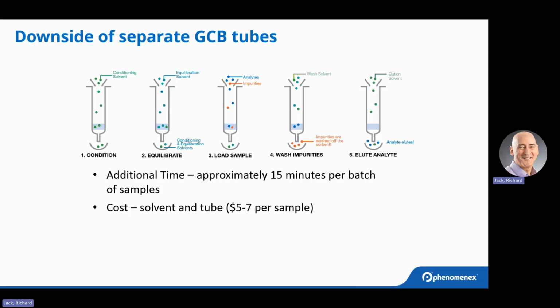Where you have a separate tube following your solid phase extraction, but it's going to add additional time. So a lot of things you're going to mitigate. It's going to be much more convenient to use another cartridge.